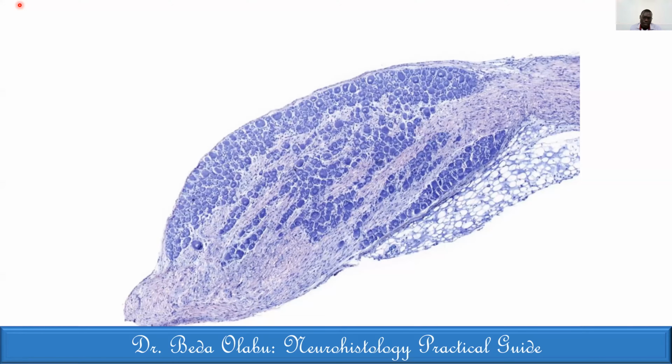So this one we are seeing, again, an encapsulated structure. I'll give you the description, then you'll give me the identification. That's the capsule. That is also the capsule. This is adipose tissue just around it, but not inside. That's the best I can appreciate at this magnification. I can see several cells within the capsule with some fibers inside the capsule, but no great detail.